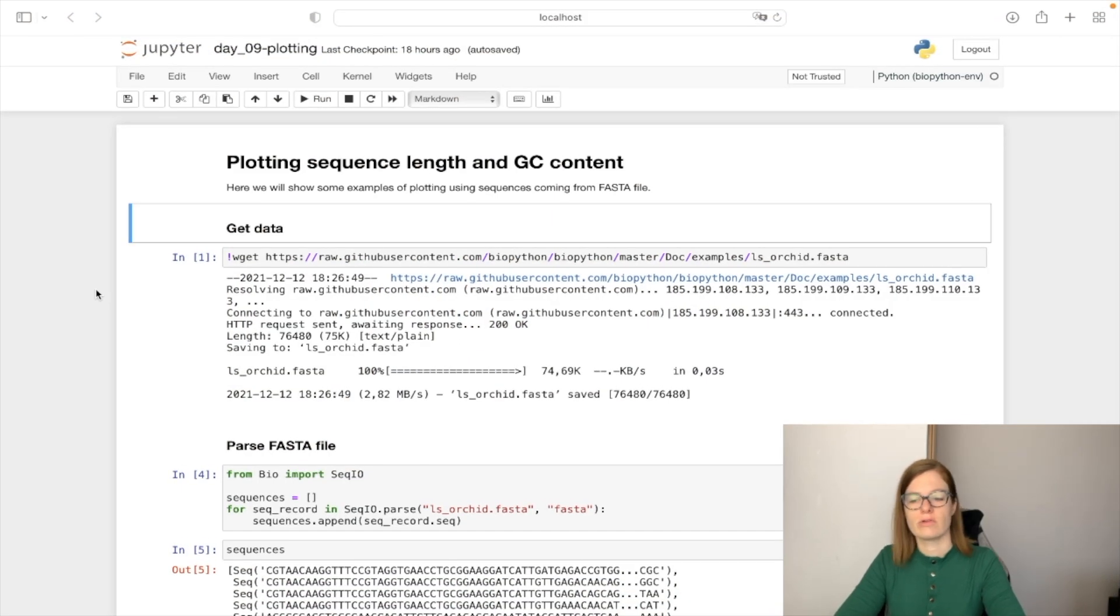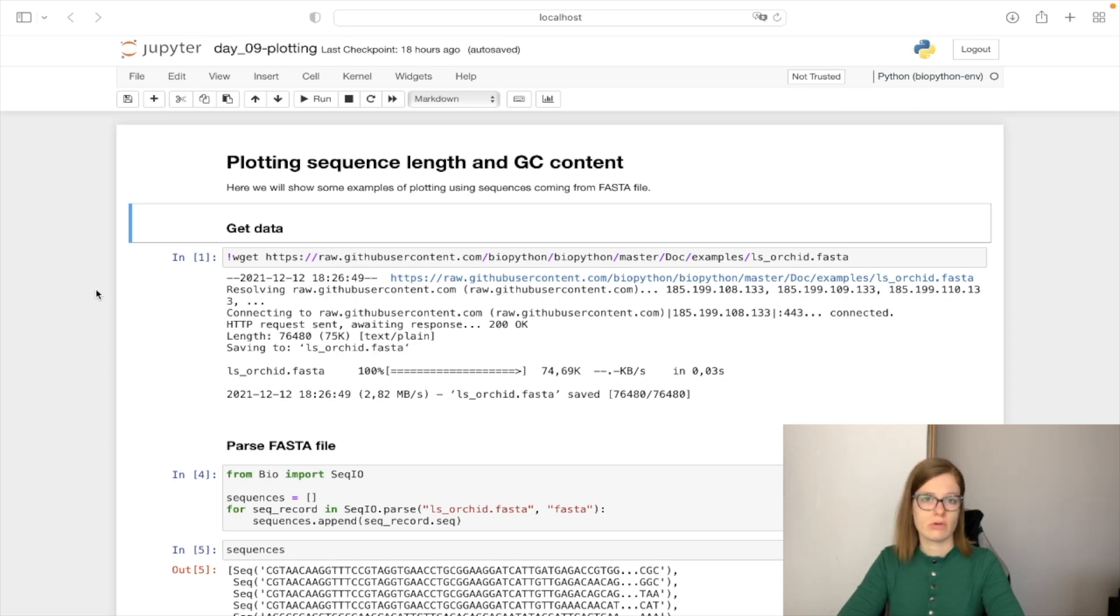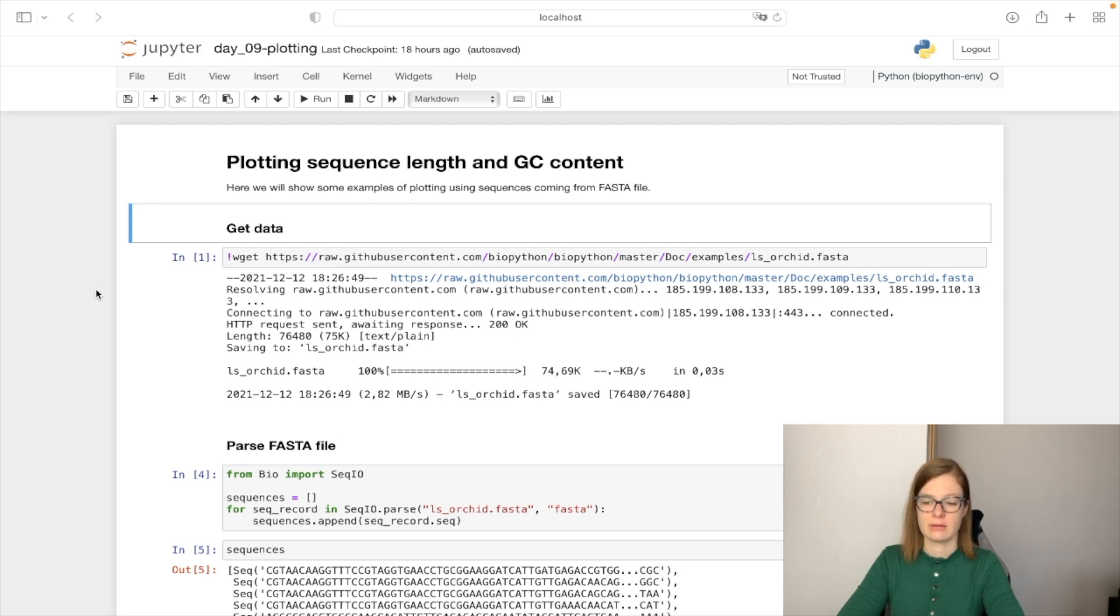Here I'm going to show you some examples of plotting using sequences coming from FASTA file. I'm going to show you how to plot sequence length and how to plot the GC content.